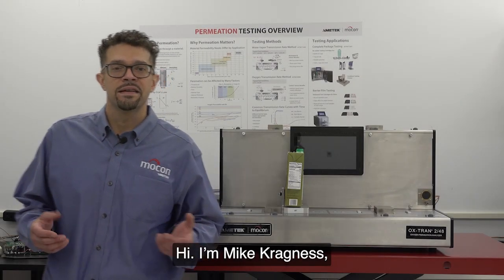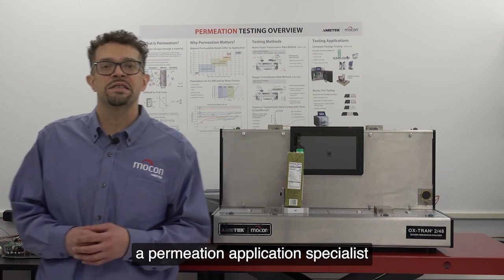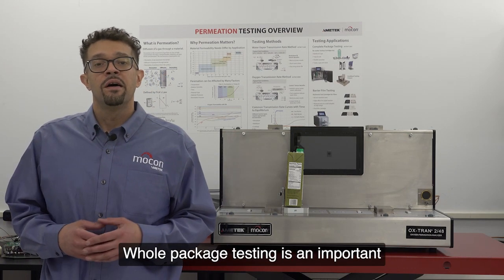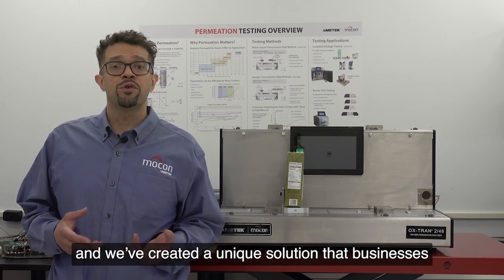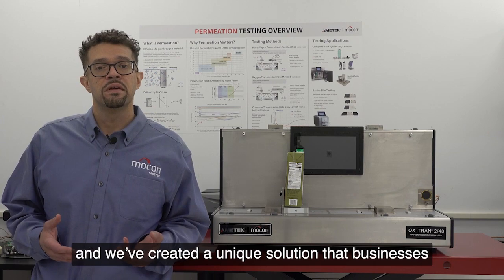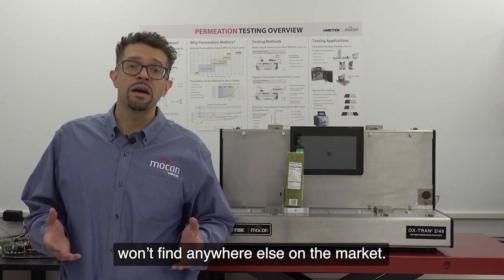Hi, I'm Mike Kragness, a permeation application specialist here at Ametek MoCon. Whole package testing is an important part of the manufacturing process, and we've created a unique solution that businesses won't find anywhere else on the market.